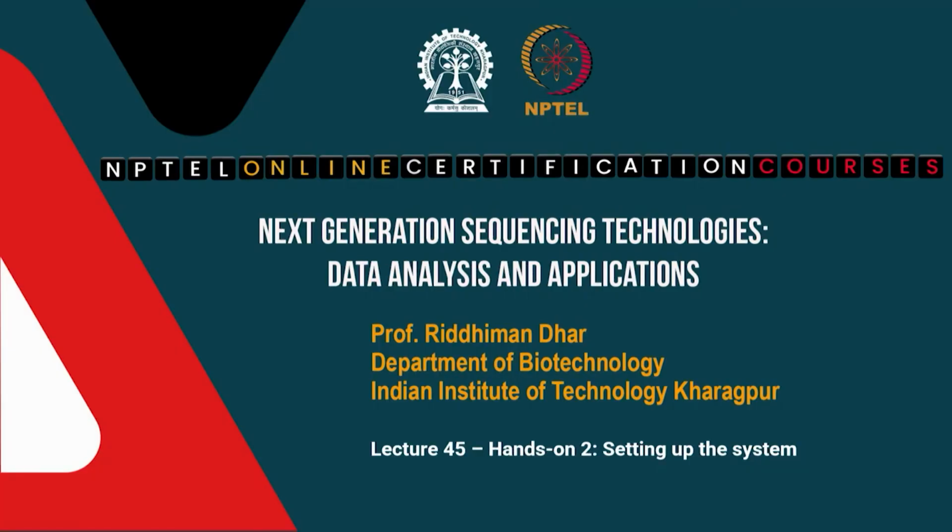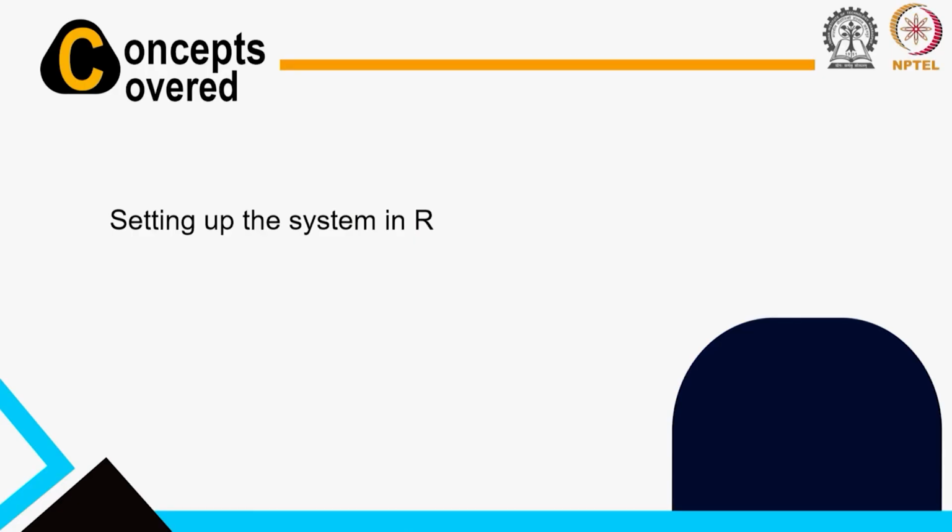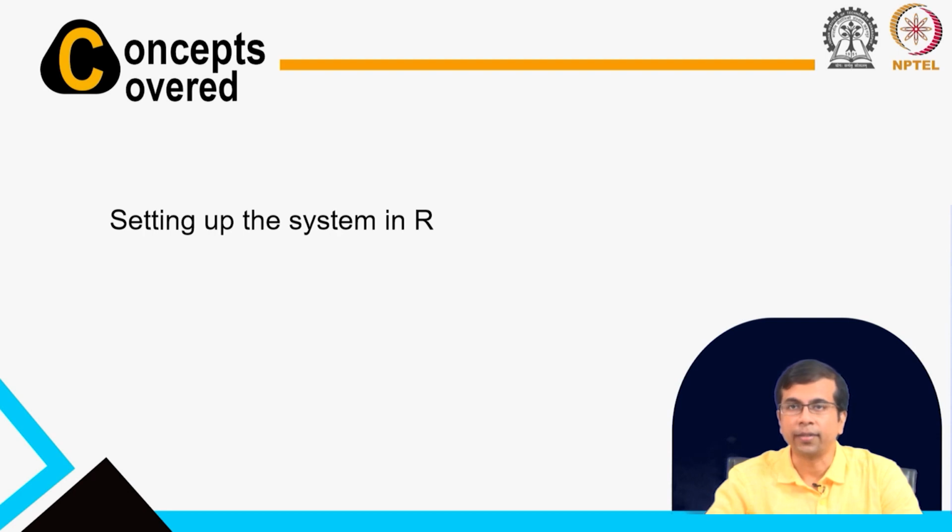In the last class we started our hands on and we focused on installing R and setting up the system. We will continue that in this class. So, we will set up the system in R. I will show you how you can get this data and how you can start loading packages in R for all sorts of analysis that will come afterwards.